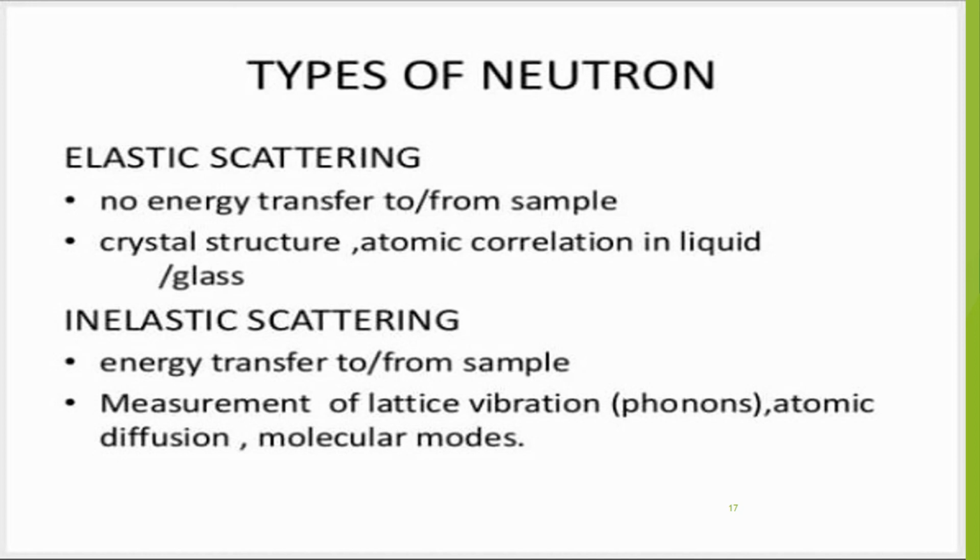While in inelastic scattering, energy transfers occur from or to the sample. So measurements of lattice vibrations, phonons, atomic diffusion and molecular modes are studied by using inelastic scattering.